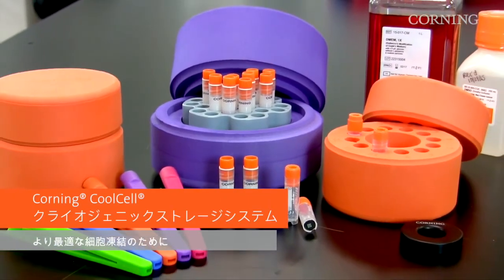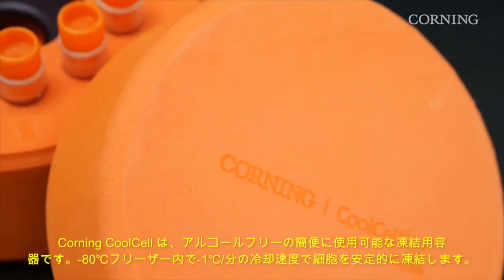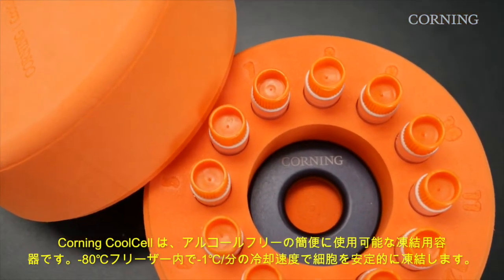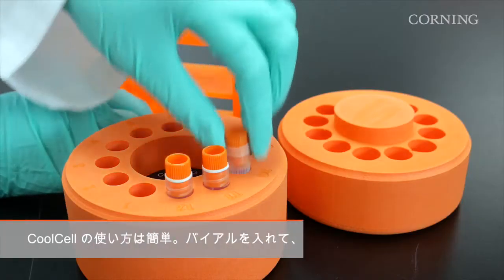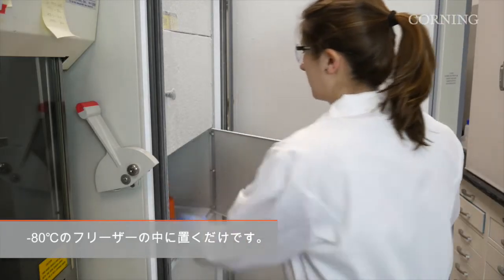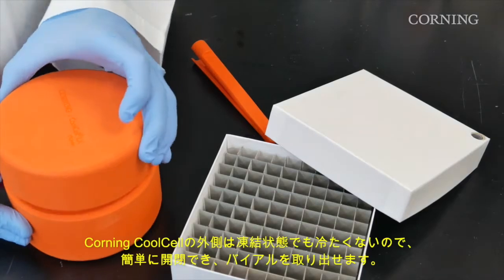Corning Cool Cell cryogenic storage systems — a new and improved way to freeze your cells. Corning Cool Cell is an easy-to-use, alcohol-free cell freezing container which controls the rate of freezing to negative 1 degree C per minute when placed in a negative 80 degrees C freezer. To use Corning Cool Cell, simply insert your vials and place in a negative 80 degrees C freezer. Within four hours, your samples will be safely frozen.